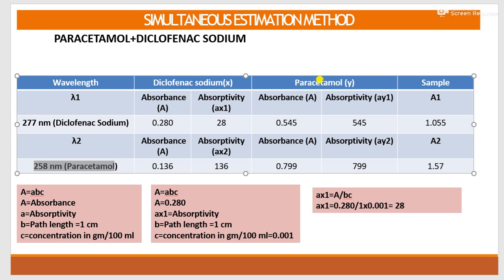Diclofenac is our X and paracetamol is our Y. When the absorbance of 10 ppm diclofenac sodium is taken at both wavelengths, absorptivity is calculated from it. Similarly for paracetamol, that is Y, absorptivity at both wavelengths is measured, and for the sample you have to take absorbance at both the wavelengths.